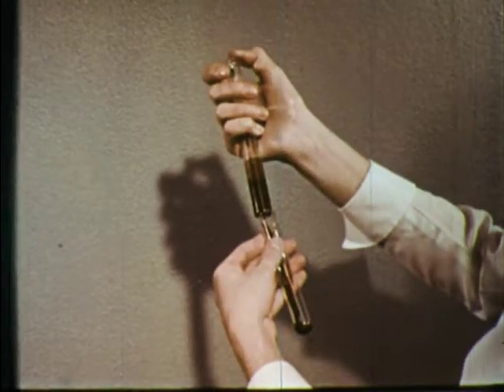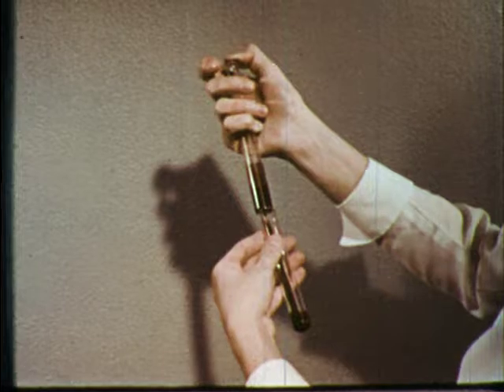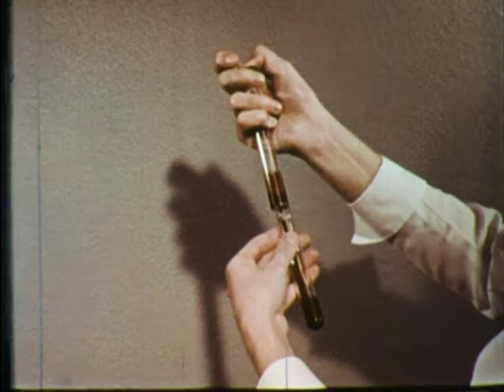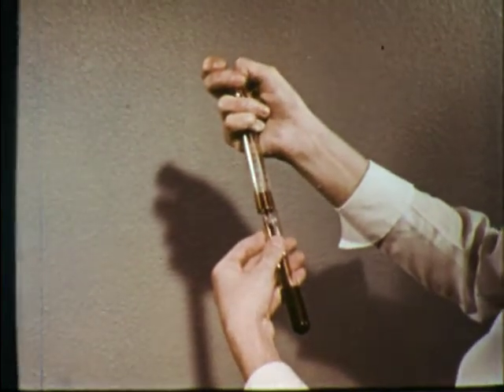This is blood. We shall use this sample to learn something about its composition as we begin our investigation of how the blood assists in the maintenance of life. In our first test, we are filling a tube so that we can spin it in a centrifuge.